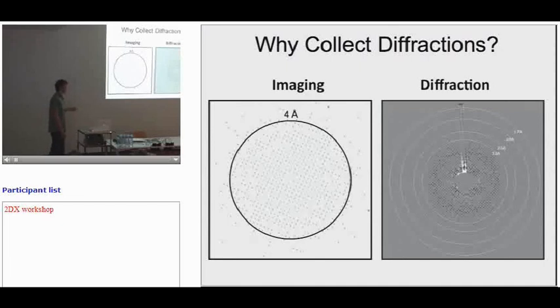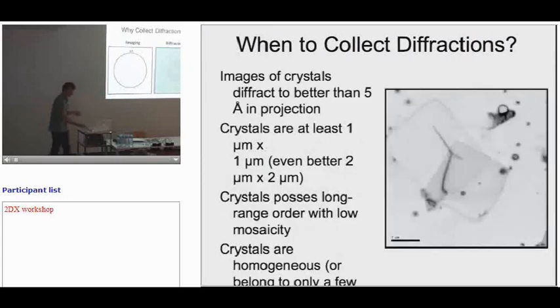Normally, this isn't an issue because you're limited by the quality of the crystals. Most crystals, as Werner said last night, don't extend this far, so you're not worried about the loss of resolution. You're probably going to get the same quality from both imaging and diffraction, but this is just a lot easier to do.